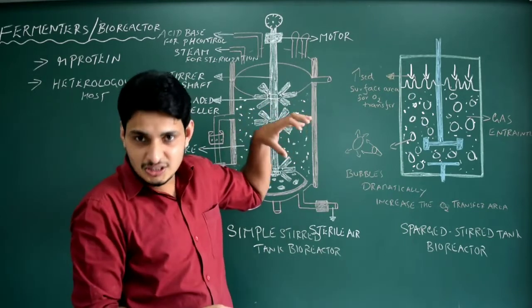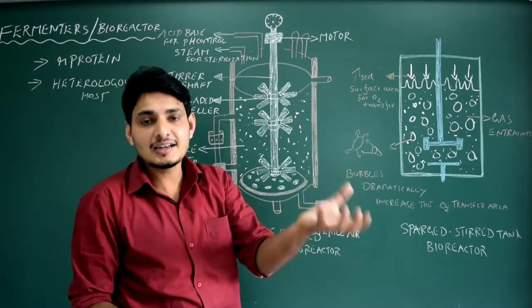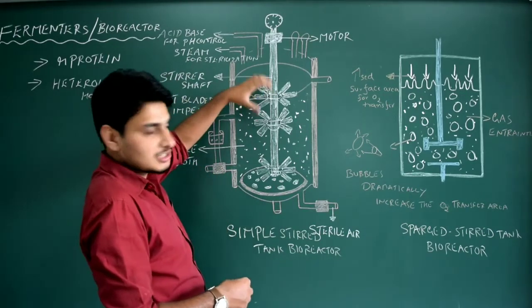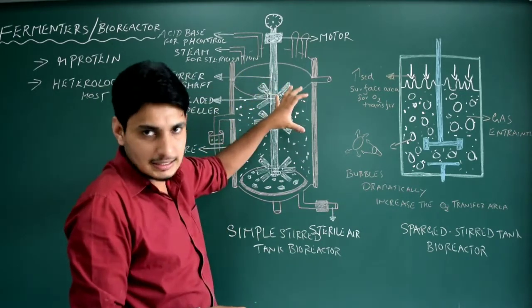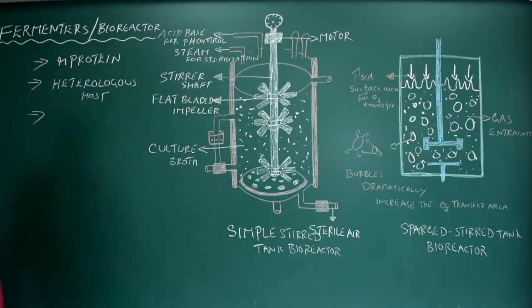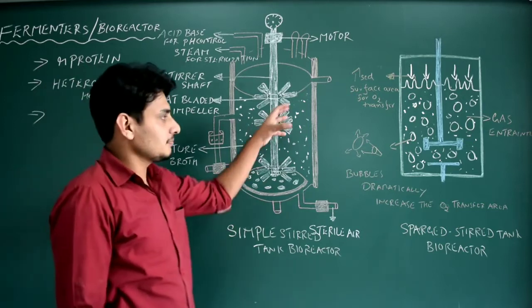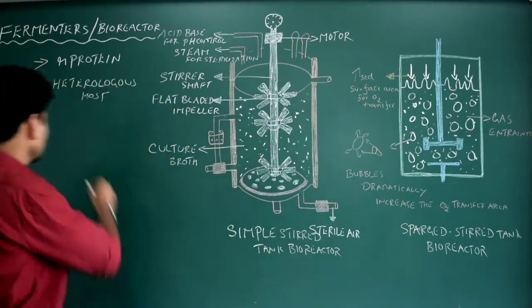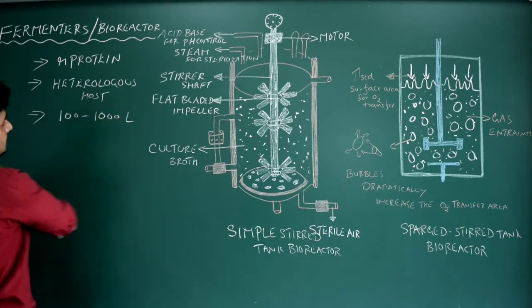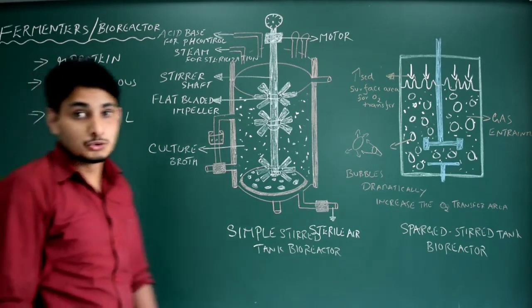That is recombinant protein synthesis. So this is actually the goal. I need to increase the rate of production of the recombinant protein, so I have to transfer everything, the host organism, into a big vessel. Normally steel vessels, not your kitchen vessels. The capacity of these vessels is 100 to 1000 liters. Large, huge vessels actually.